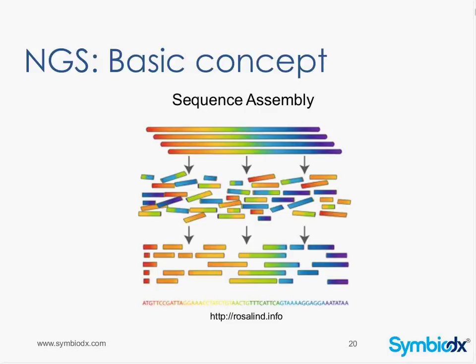Sequences figured out, we need to reassemble them. So basically all of this needs to turn into all of this. There are actually 2 different ways to accomplish that. One of them is the de novo method, where we would just take them all and figure out which pieces match and line them up on top of each other in this fashion so that we could then produce the sequence down here.